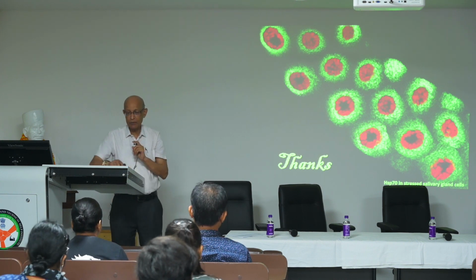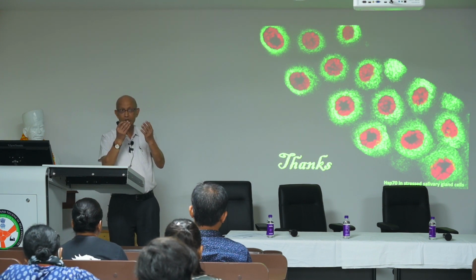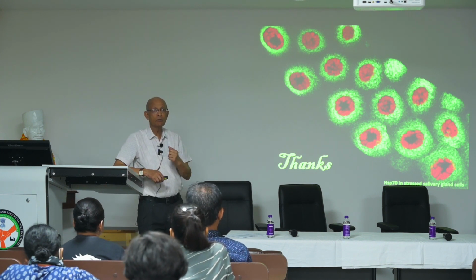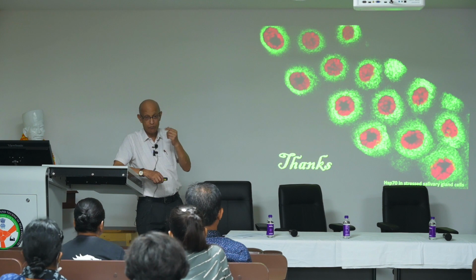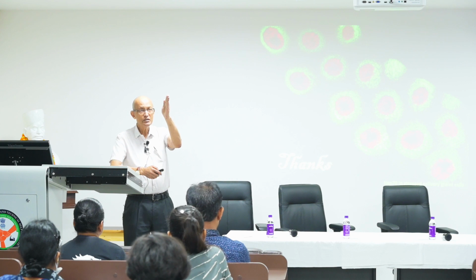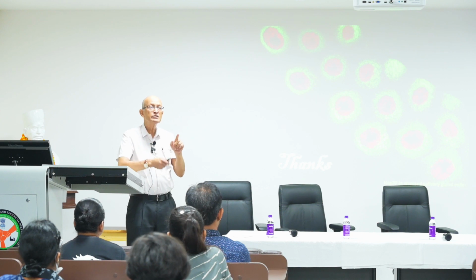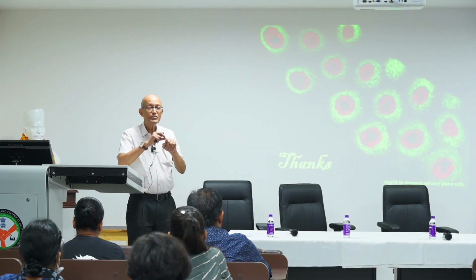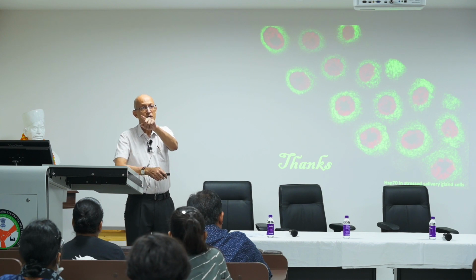So in a multiphoton system, what happens is that we excite the object with a longer wavelength. Not the excitation wavelength, okay. For example, if my fluorochrome needs 450 nanometer excitation, I'll excite it with a 900 nanometer wavelength. But if that laser is pulsing, that means it generates a laser, goes down, again generates, again goes down, and if the interval between two pulses is less than 100 femtoseconds, then the same electron, if it receives two photons simultaneously within an interval of 100 femtoseconds, will move to the higher orbit.